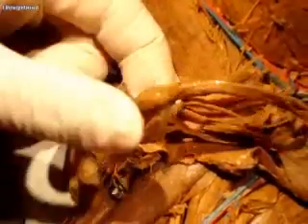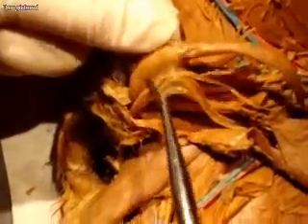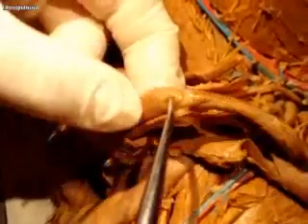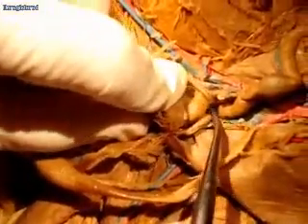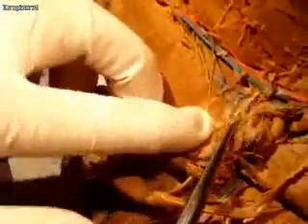The epididymis is kind of lower on these animals, so this is epididymis here. This part here is all testis. This is where the seminiferous tubules are, and this is all epididymis. And the epididymis comes up and becomes the vas deferens, and the vas deferens loops up around behind the bladder to go into the back there and form part of the urethra. It looks like your penis is still covered up. You left it covered. Okay.